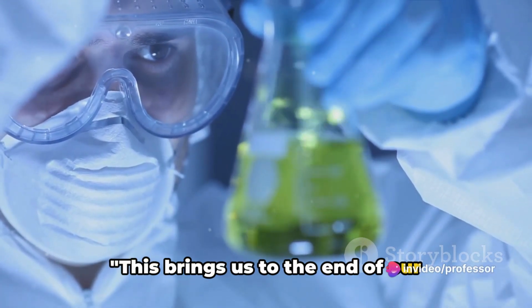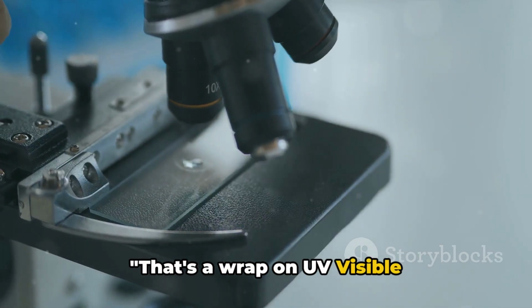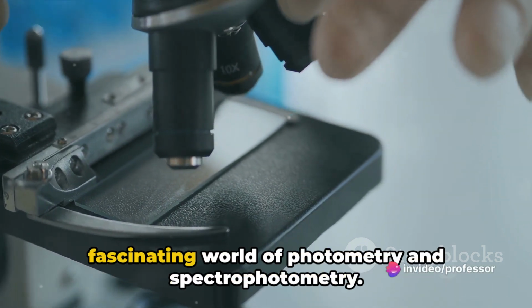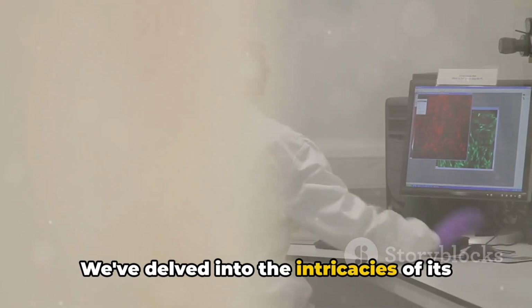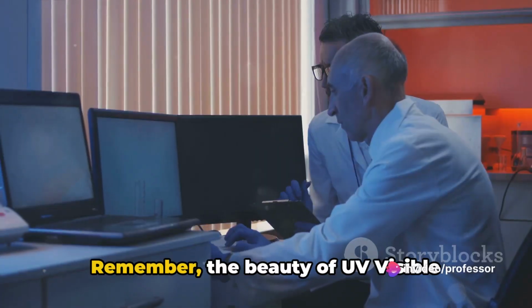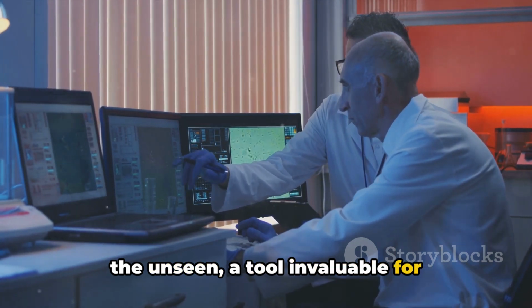This brings us to the end of our exploration of UV visible spectroscopy. We've covered a lot of ground, but there's always more to learn. That's a wrap on UV visible spectroscopy. Today we've journeyed through its theory, explored Lambert's law, Woodward rule, and the fascinating world of photometry and spectrophotometry. We've delved into the intricacies of its instrumentation, tackled the complex analysis methods, and seen its practical applications. Remember, the beauty of UV visible spectroscopy lies in its ability to unveil the unseen, a tool invaluable for scientific research.